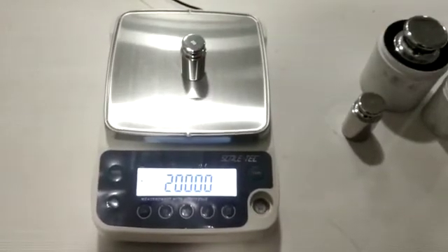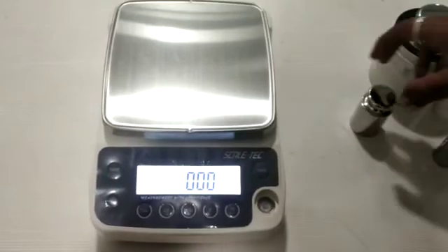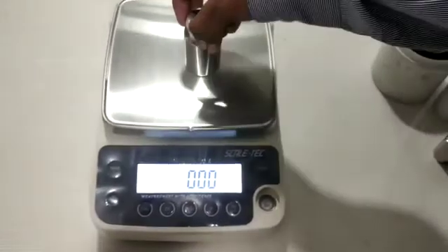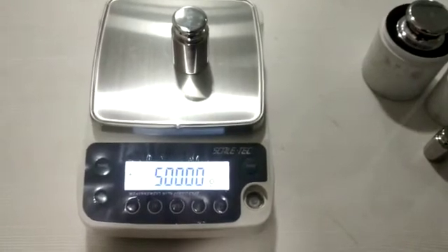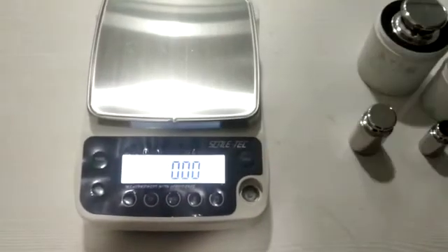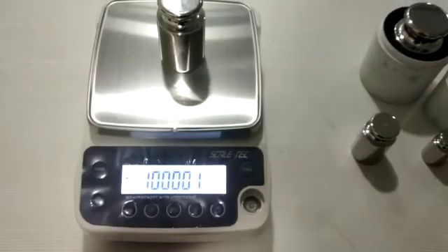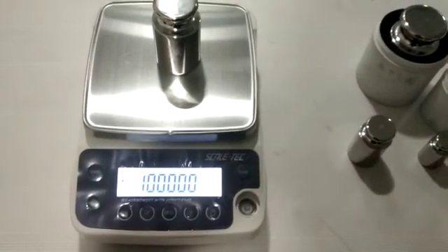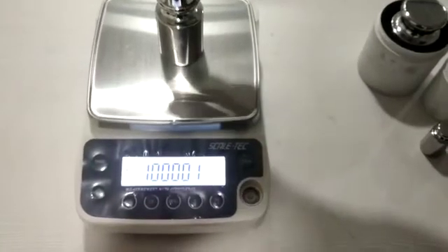First I will put 200 gram, then after 500 gram, after that 1 kg.